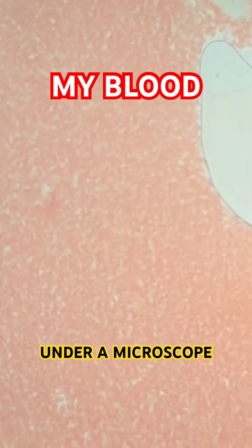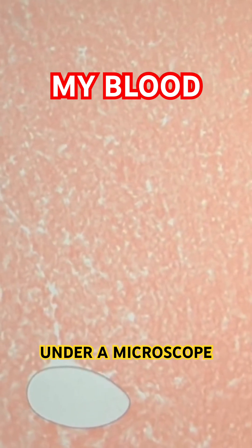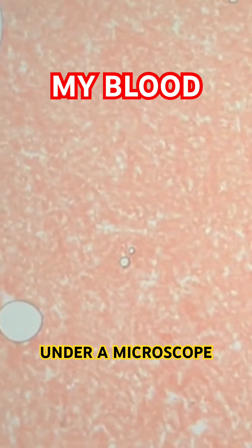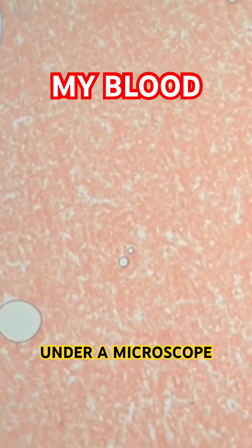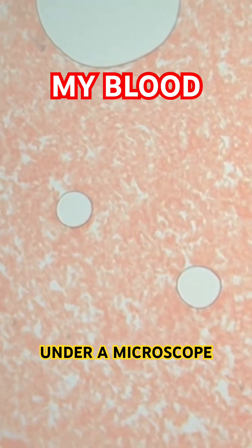Can y'all see it? Let me just focus this camera. All right, so what you're looking at is — I assume there's red blood cells. It looks like a river flowing. That's pretty neat. Anyways, that is 40 magnification.